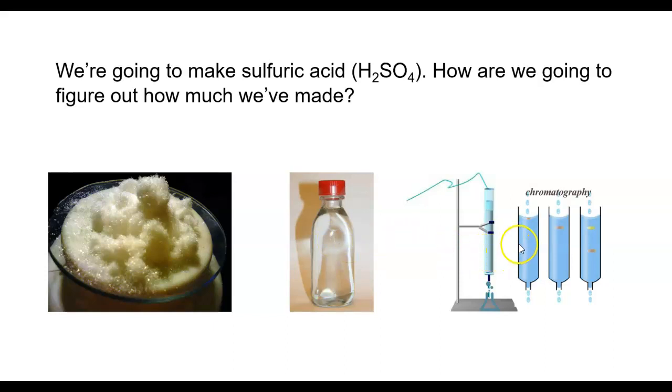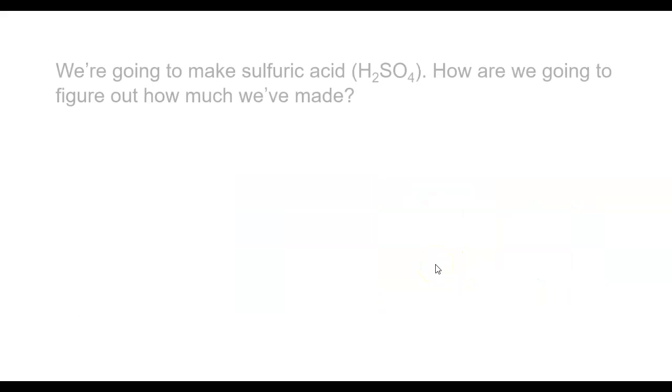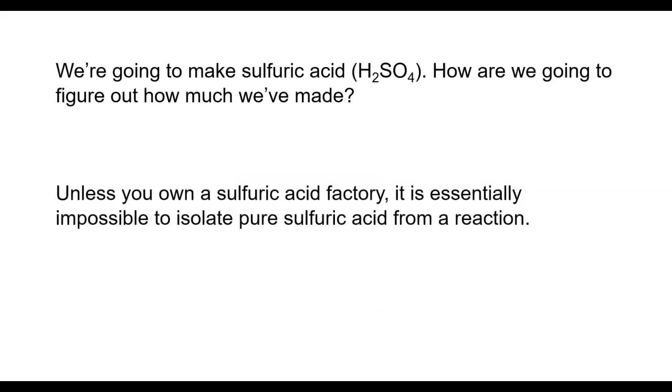Sometimes you have to do what's called column chromatography, which is not something I'm going to talk about in detail, but this is a way of separating things, say, that are mutually soluble, so there's no real easy way to get them apart. And once you've isolated your product that way, then you can weigh it and figure out how much you've got. You cannot do that with sulfuric acid. Unless you own a sulfuric acid factory, it's essentially impossible to isolate pure sulfuric acid from a reaction.